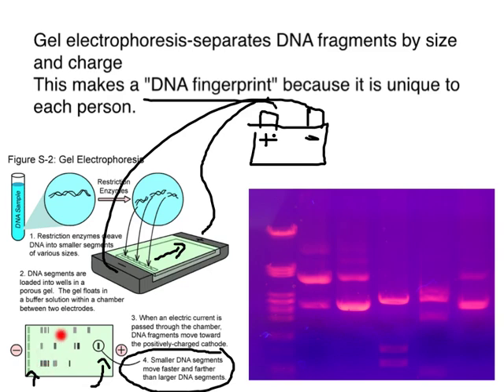You can see the bands of DNA on these gels here. This is what a gel looks like in real life. This gel has had a fluorescent dye applied to it, so it glows. But that's pretty much it. It's a simple process. It takes about 30 minutes of lab time to do. Really the hardest thing is maybe getting the RFLP done first, and that might take another 30 minutes or so to let the enzyme digest, but really it doesn't take long to make one of these.